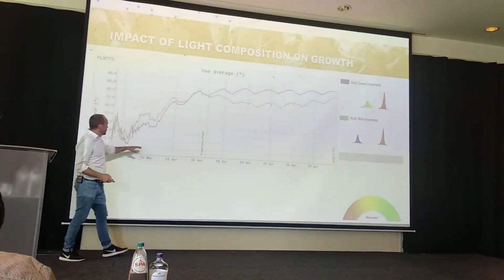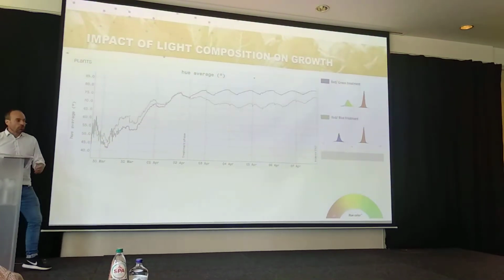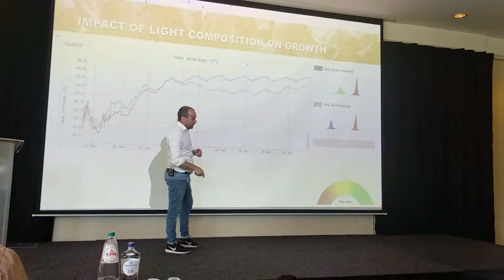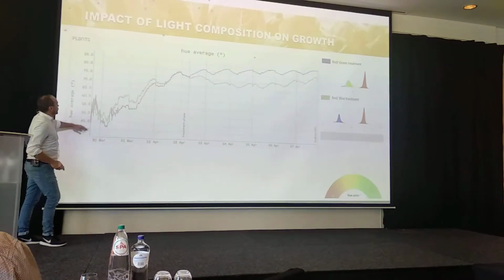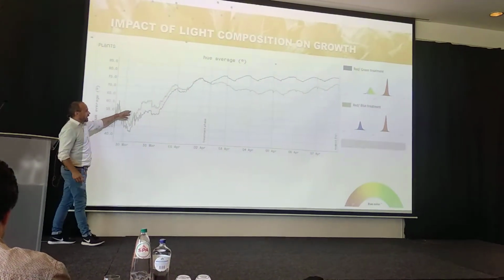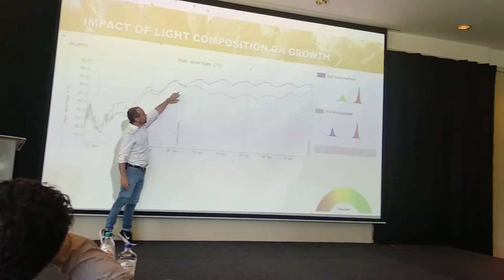Again, this is the time. Machines cannot tell whether it's red or light red, so we transform a color into a number. Very roughly, red here is 0 and green is 90 degrees, and in between we have all these different shades of color. And that's exactly the scale you have here. So we put the plants into the experiment. The plants were coming from a grower, so they had to adapt a little before, because they were growing outside and were transported. But then they are pretty well synchronized.